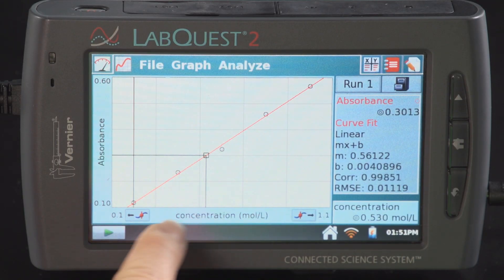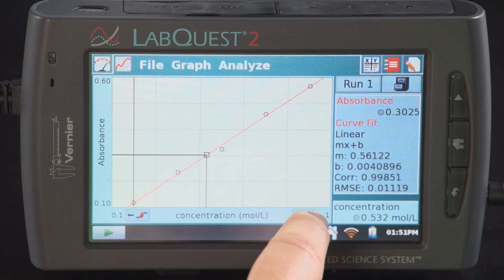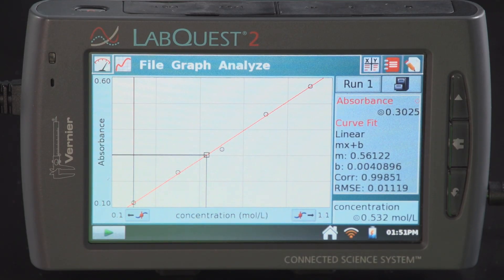You can use the nudge tools at the bottom to get close to that value. For this sample, the unknown absorbance has a concentration of 0.532 based on my calibration curve, and that unknown value is displayed in the lower right corner.